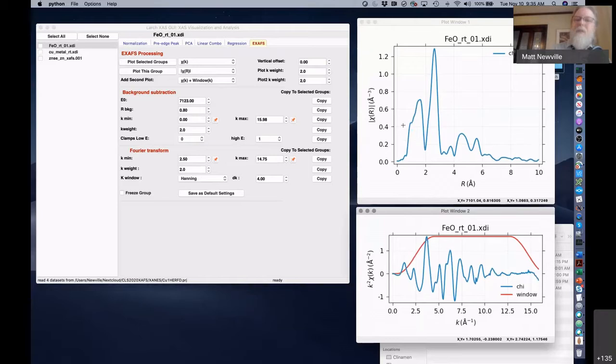There is some sort of stuff in here that you may not love, but actually that's in the data, and it's involved with the K max range. I would say that actually looks pretty good. So all of that stuff at low R in here and the changes in that, that's just how you do the Fourier transform, and not such a big deal.